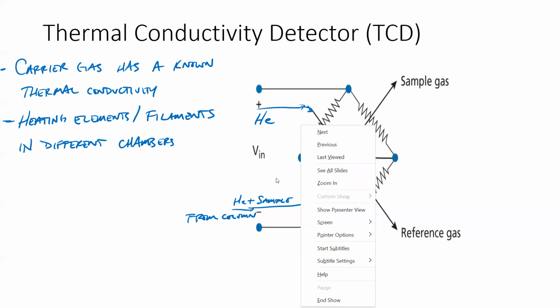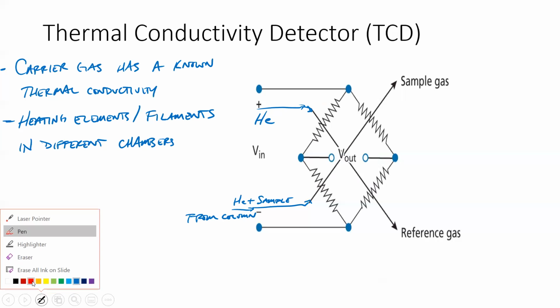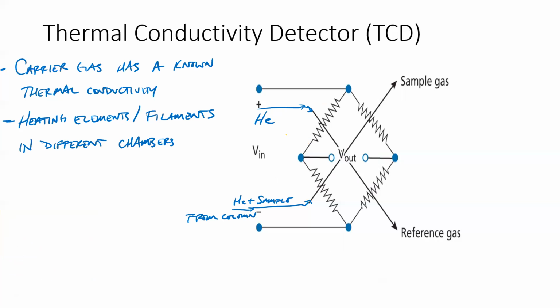So on the left side of our diagram, these things are heated up to a certain temperature, and then the temperature is measured over here.